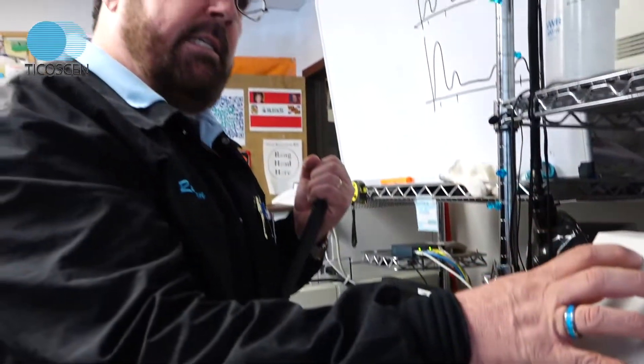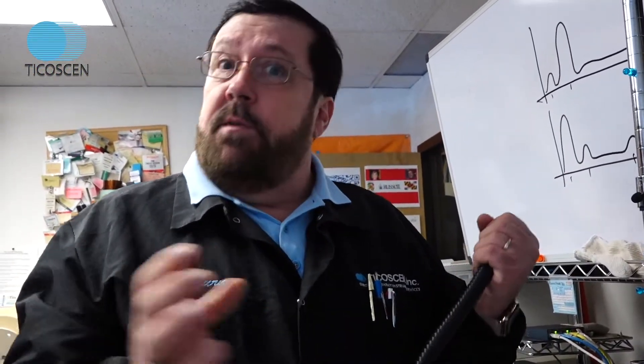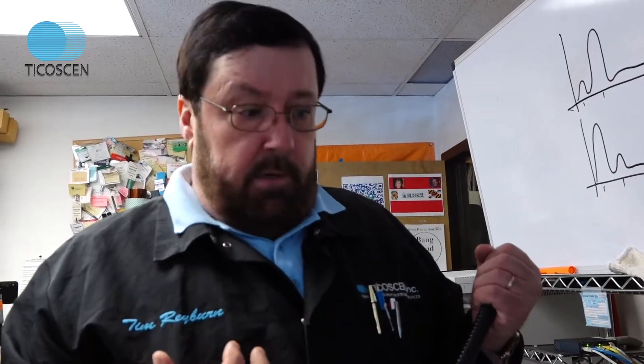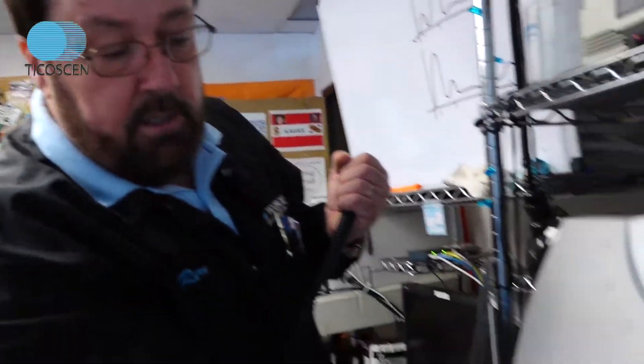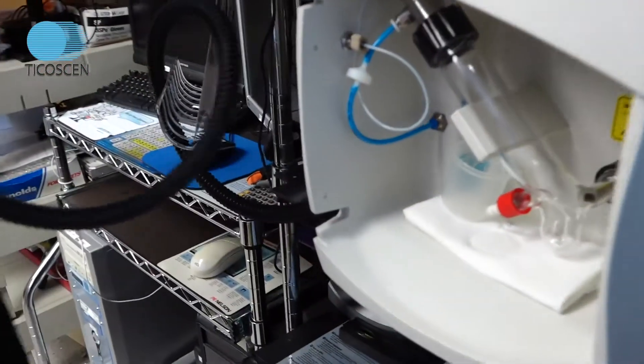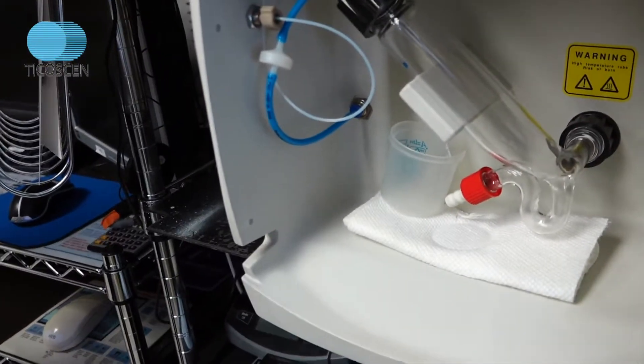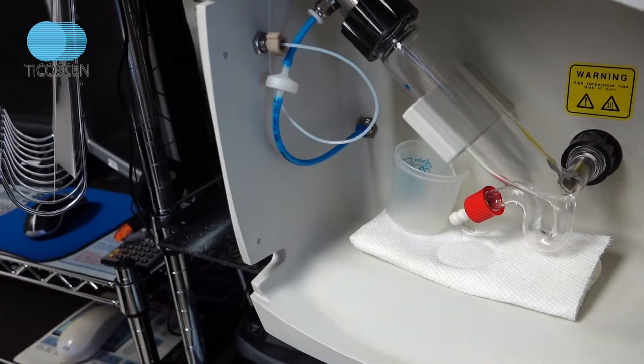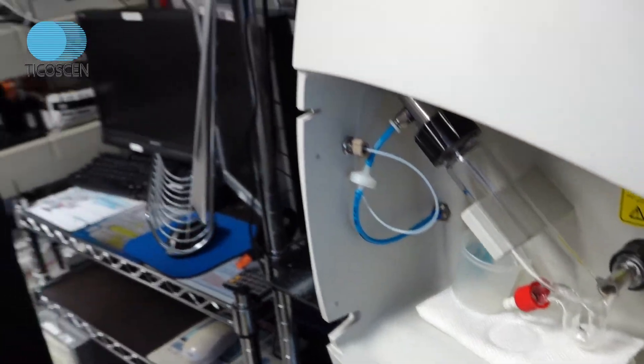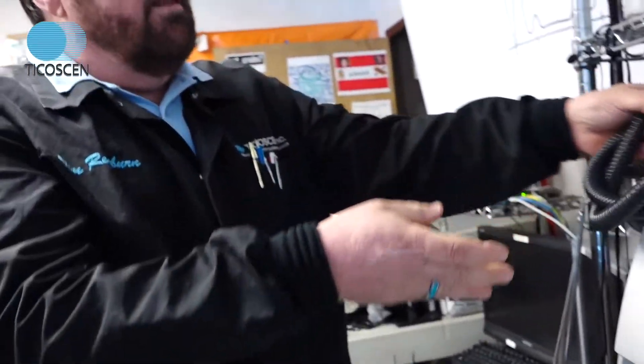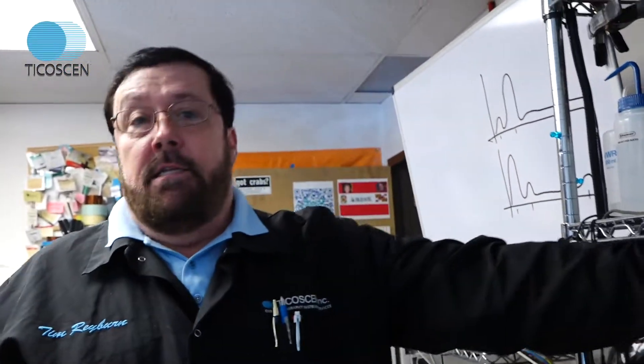Because the atmospheric pressure inside the detector needs to be equal to the atmospheric pressure outside. Except there's nitrogen in there and we breathe air out here. But this will tell you right here if there's a problem with your exhaust. And exhaust is a constant problem I run into with clients. Because people either have it too strong of a vacuum or they have a complete blockage. And then the detector doesn't work.